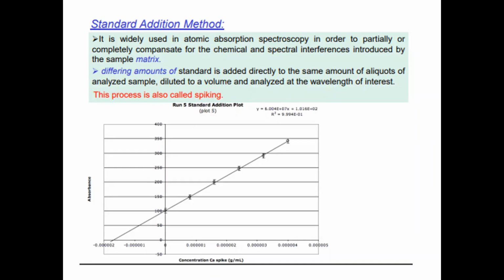Okay, if there is 5 ppm of lead, then you get the reading from the 5 ppm of lead before you add anything, at 0. And then when you spike it, you get this reading here after spiking it with a certain concentration, grams per milliliter or molar concentration, whatever the concentration.